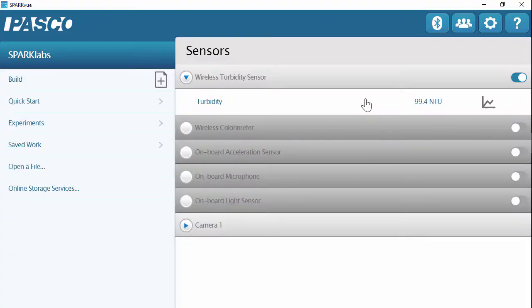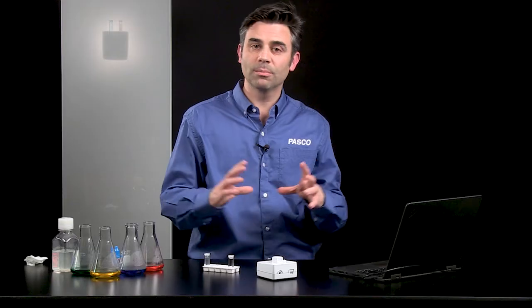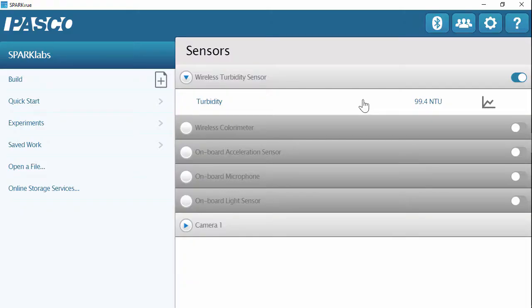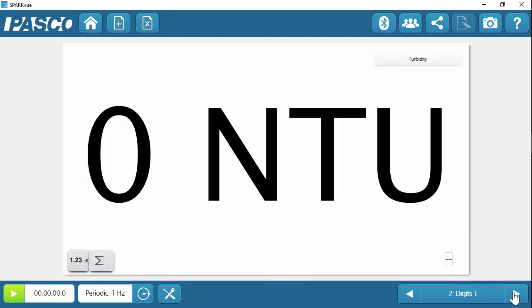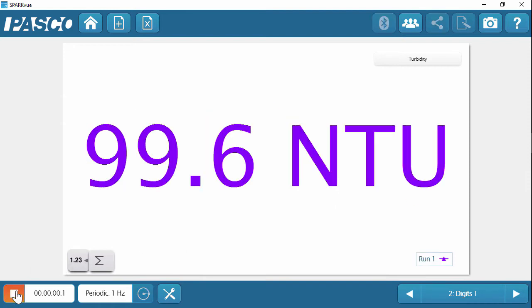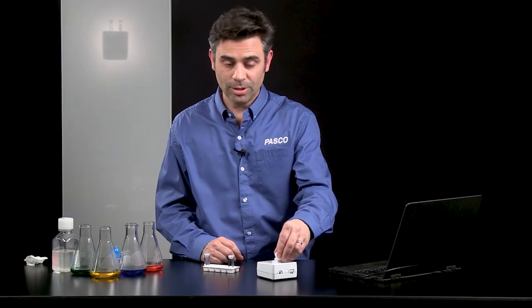So to do that, there isn't a quick start for this, but I'm just going to do a show path because I just need the measurement itself. I just want to look at the digits. So I'm going to click on turbidity. I get a graph right away. It's going to use this arrow to have a nice big display of my NTU. I'm still reading about 100 for my standard, which is great.